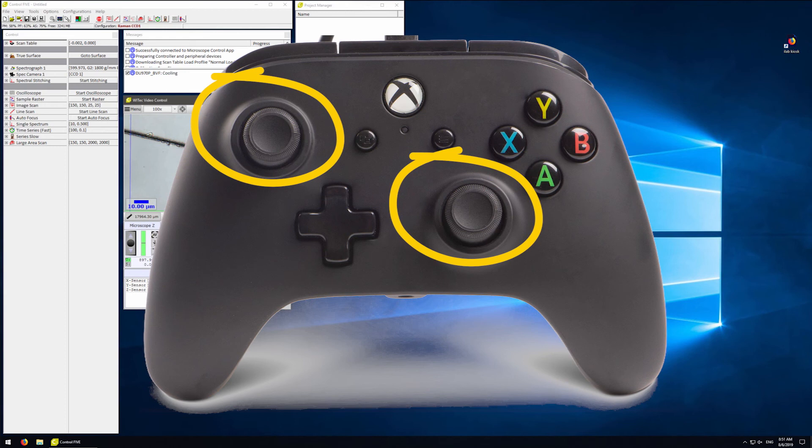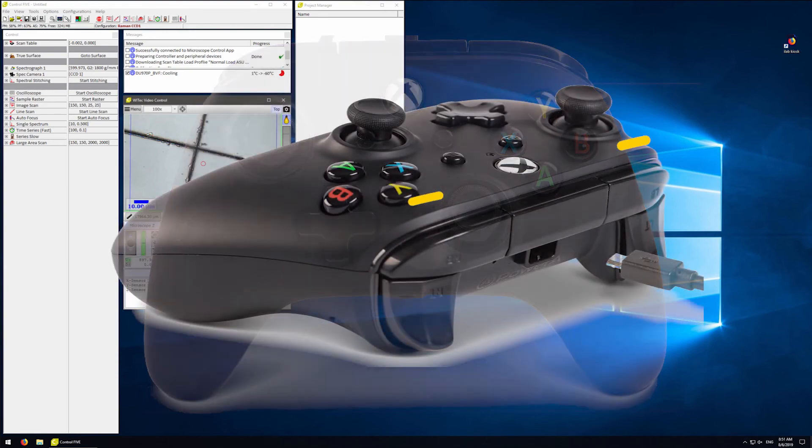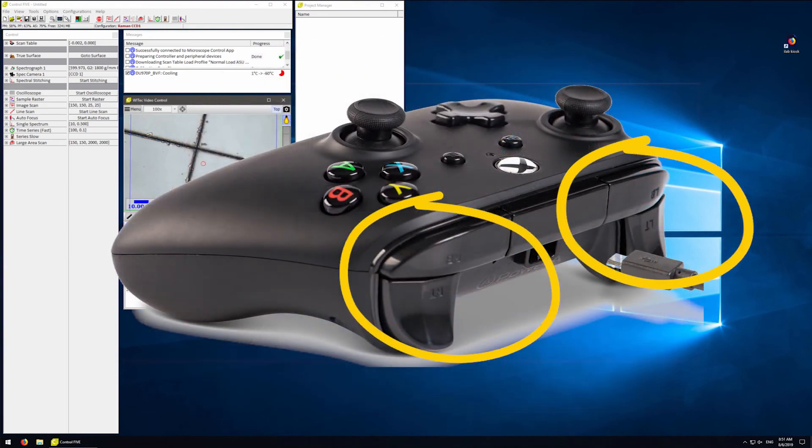The right joystick controls the sample position forward, backward, left, and right. If you push on the joystick, you will get one-step motion. The back buttons control the continuous speed.